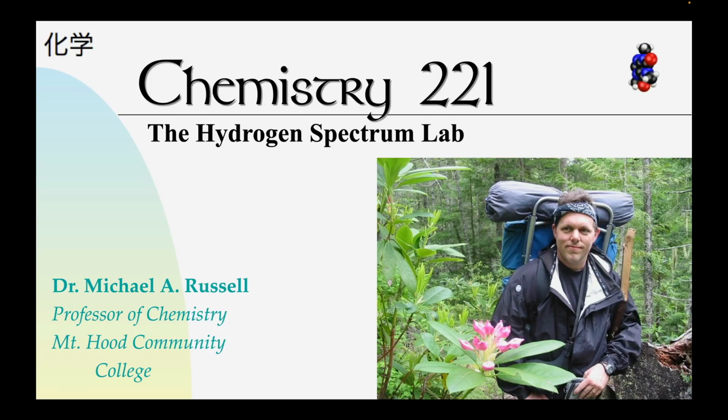Greetings and welcome to the lab introduction to what we call the Hydrogen Spectrum Lab. This is a fun lab where you'll get to see essentially a fancy type of light bulb. I know that sounds weird, but light bulbs actually have the same principles as the hydrogen spectrum and other things we're going to look at in this lab. It's pretty cool. This is a deviation from normal chemistry.